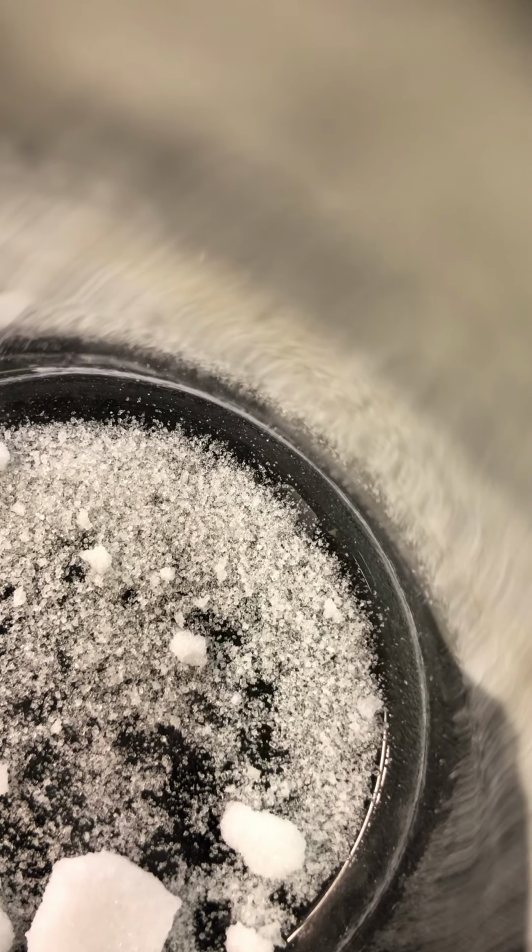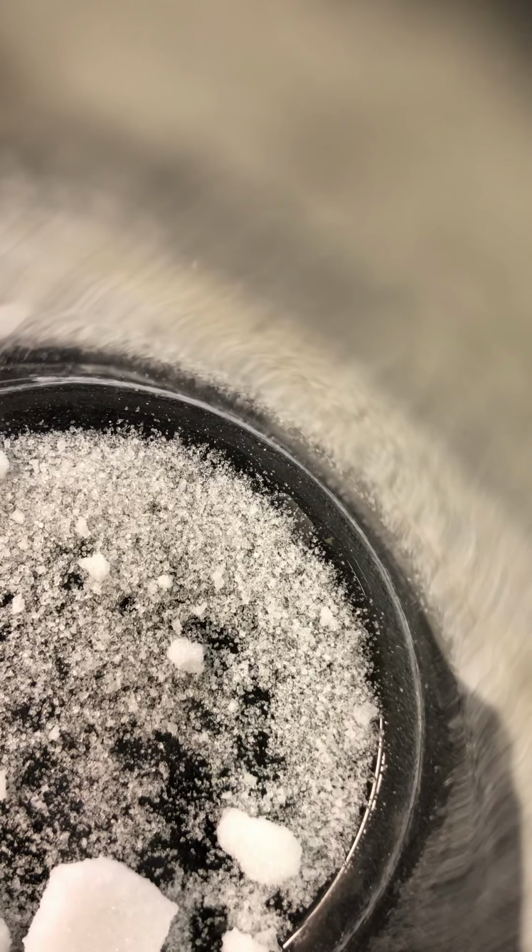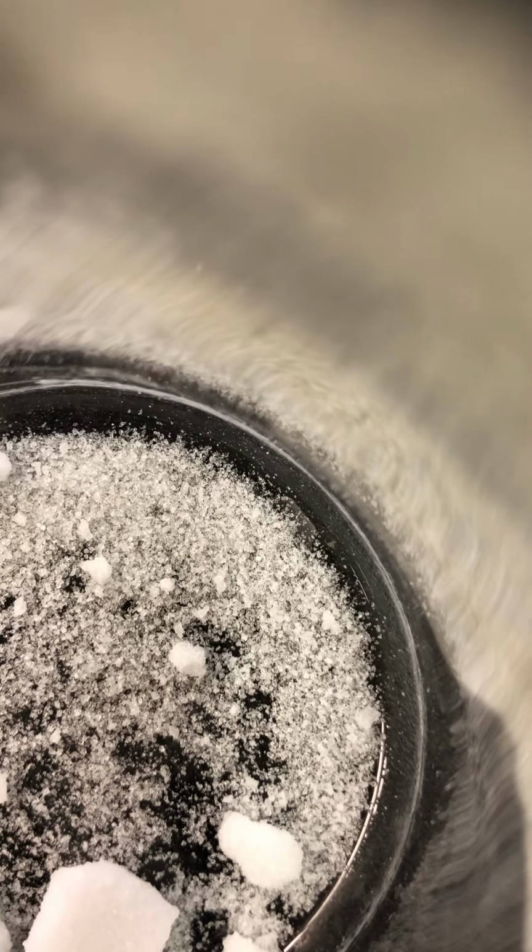Please don't look at the chunks here, just look at the individual crystals. This is solid 4. And this is solid 5.